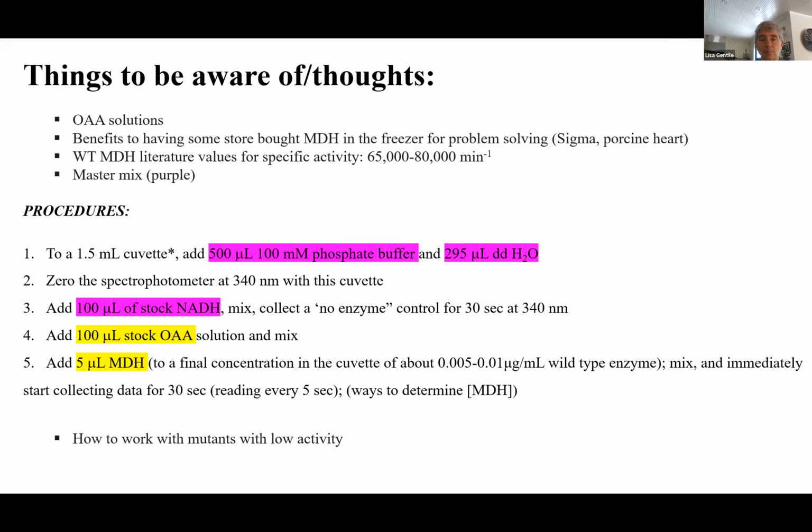Some of you have asked about whether or not it's okay to make a master mix. The fewer times that students have to pipette, the fewer pipetting errors are in the data that we get, and the cleaner the data should be. So it's definitely possible to add the phosphate buffer, the things that are in purple here. The phosphate buffer, the water, and the NADH are fine in a stock solution that you make up on the day of your lab.